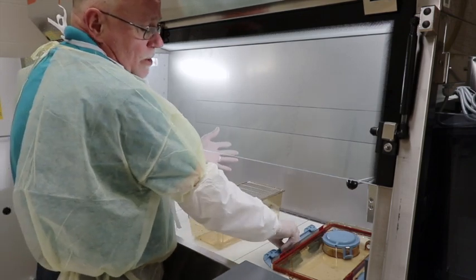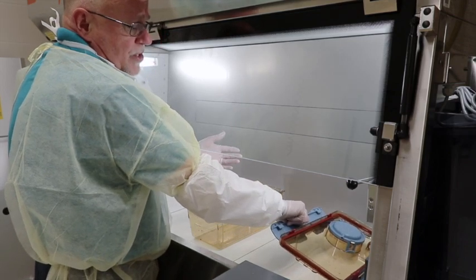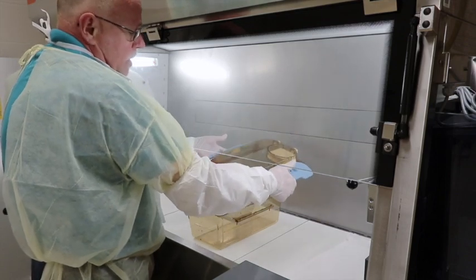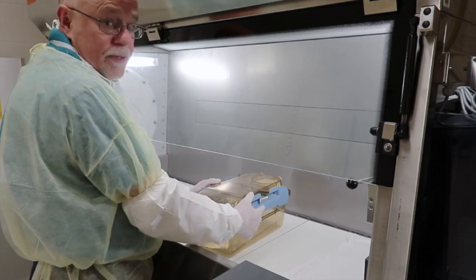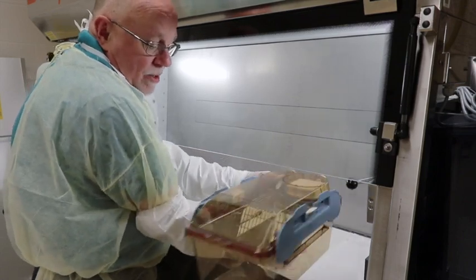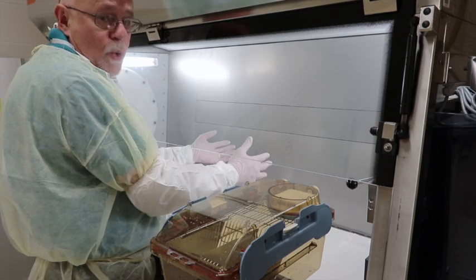After I'm done, I grab hold of the latch closest to me, bring it up, and swing the top to gain access to the other side. I can now close the cage and it is locked and ready to be used. To come out, I slide it to this point and the technician can take the cage from there.